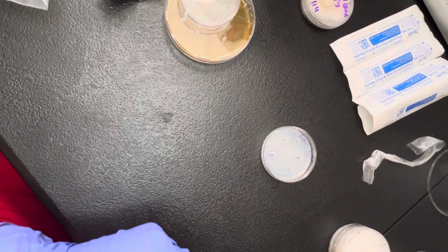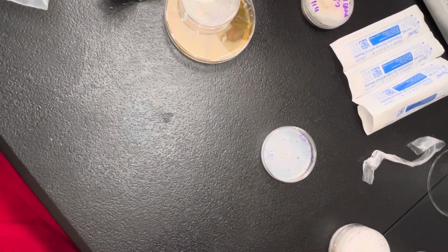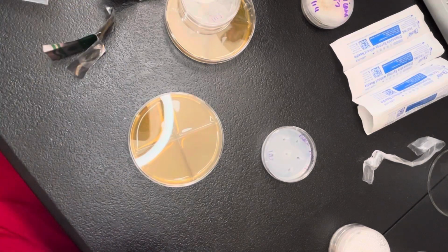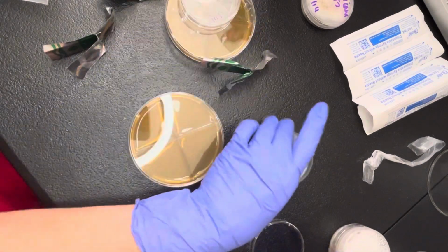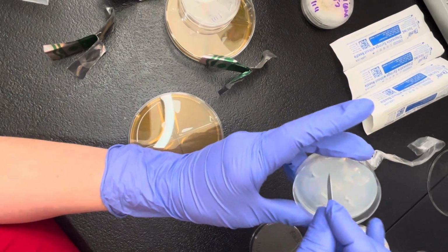Because you don't want to introduce contamination to your air, especially if you're not using a laminar flow hood, without being fully prepared to, you know, be able to clean afterwards. And I apologize, my plate is not open. So this is a low nutrition agar I used for this swab. So there's not going to be a lot of rhizomorphic growth on it.